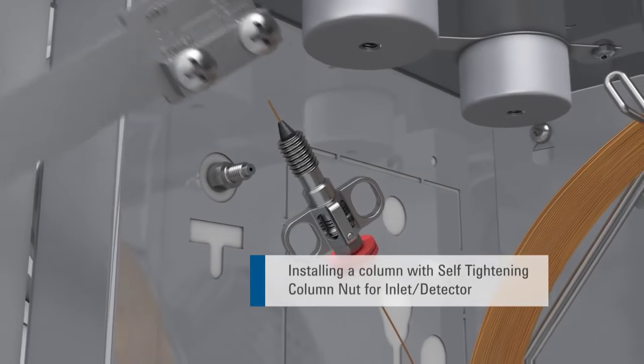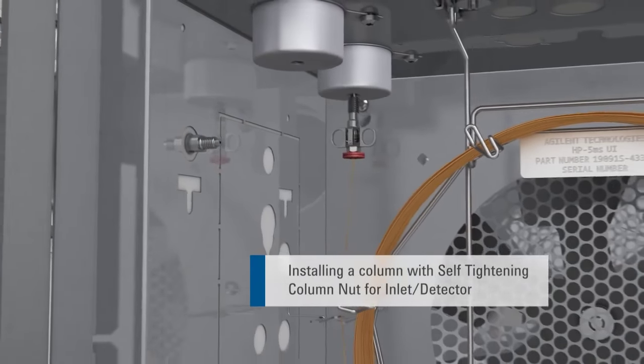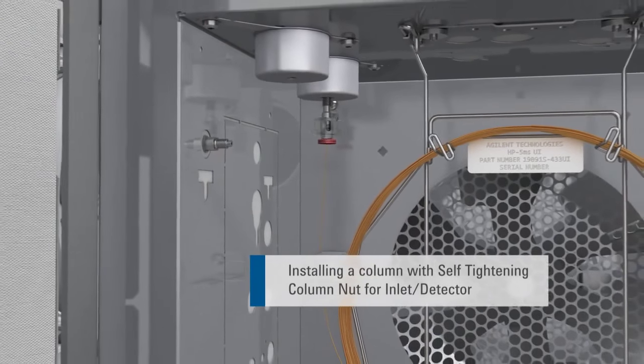Another feature of the self-tightening column nut is that a leak-free connection is made without wrenches, making installation faster and easier.